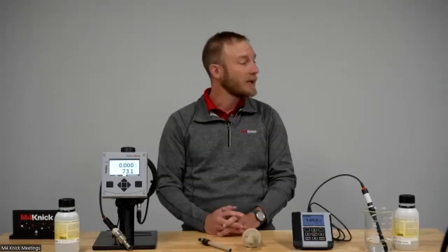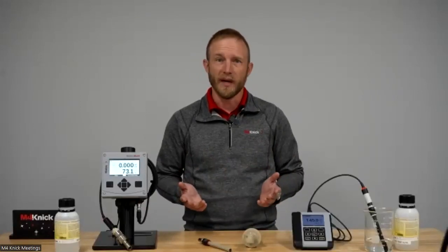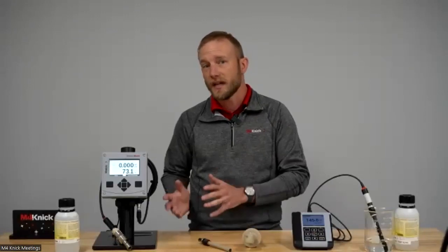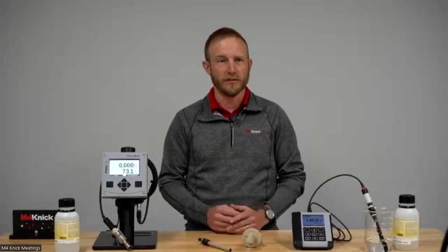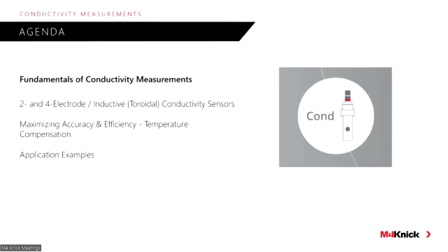Again, the topic of today's webinar is focused around conductivity measurements and specifically choosing the right conductivity sensor for your application. So we'll take a look at the agenda here. What we're going to cover today specifically is the fundamentals of conductivity measurements. There are three main types of conductivity sensors that are utilized out there on the market.